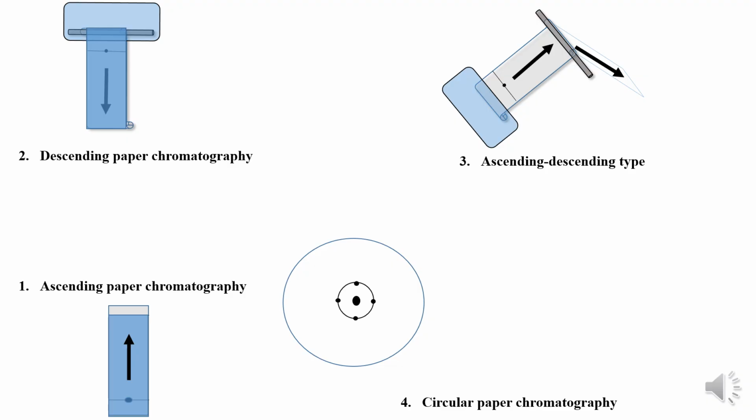You mark spots on the baseline, which will be the reference spots for the 4 different sample mixtures that have to be applied. You can label all 4 reference spots, and later apply the sample using a microsyringe or micropipette, or even a capillary, and later dry the spot.